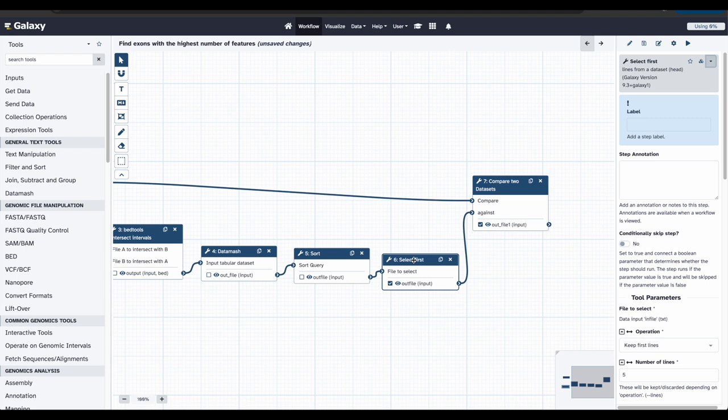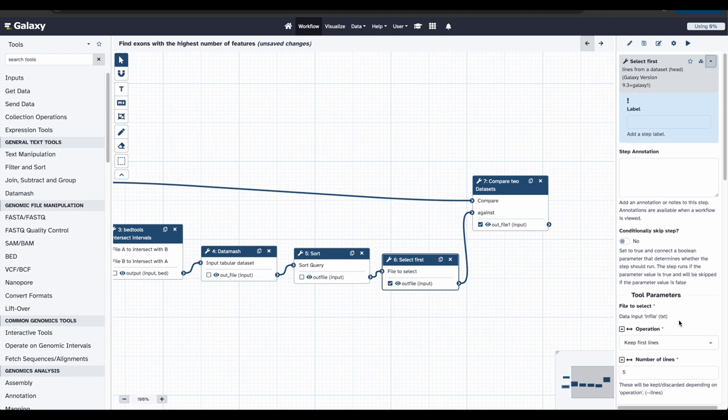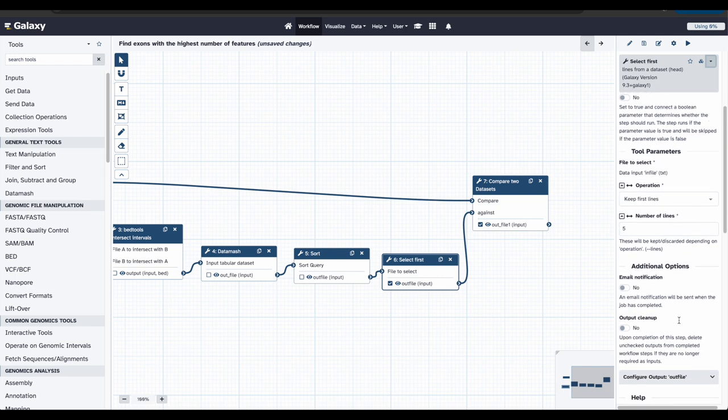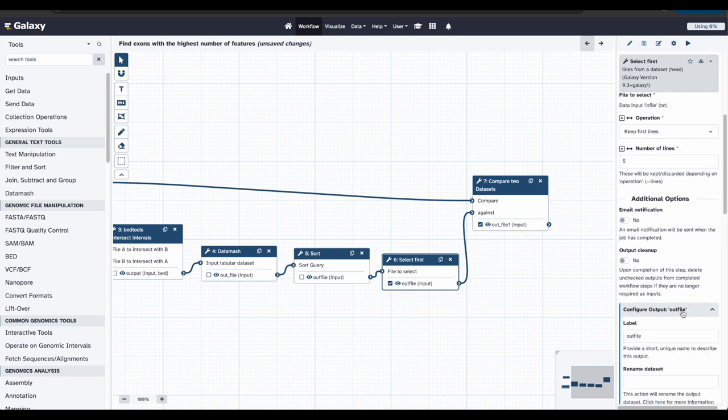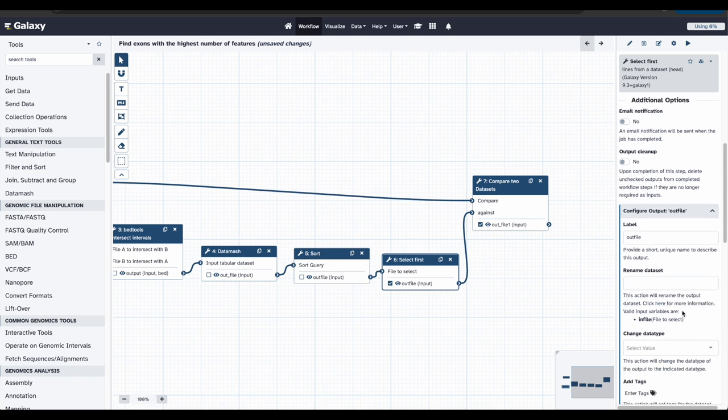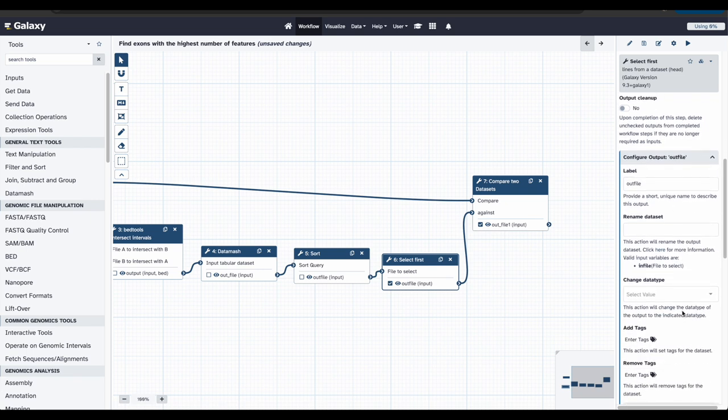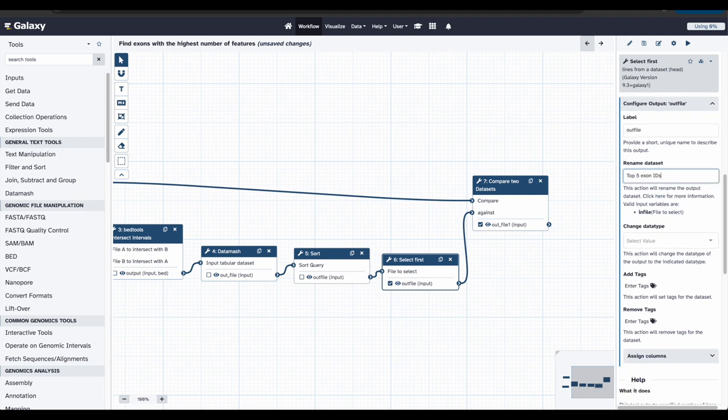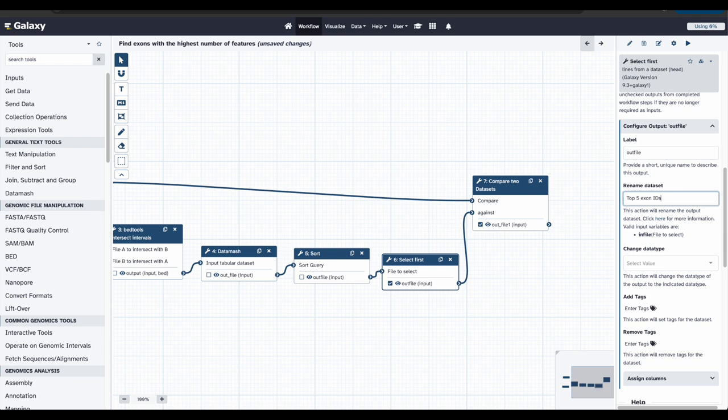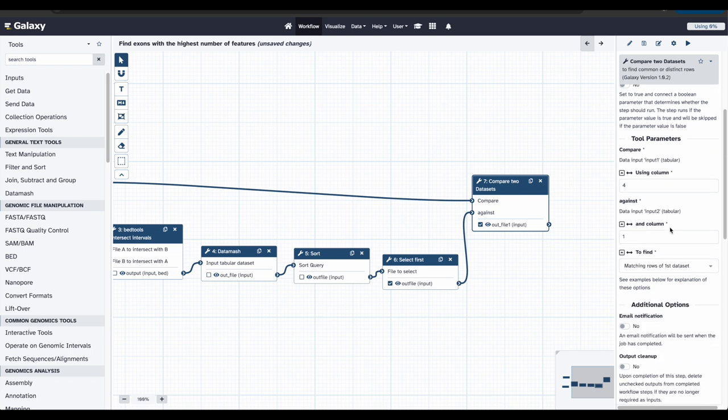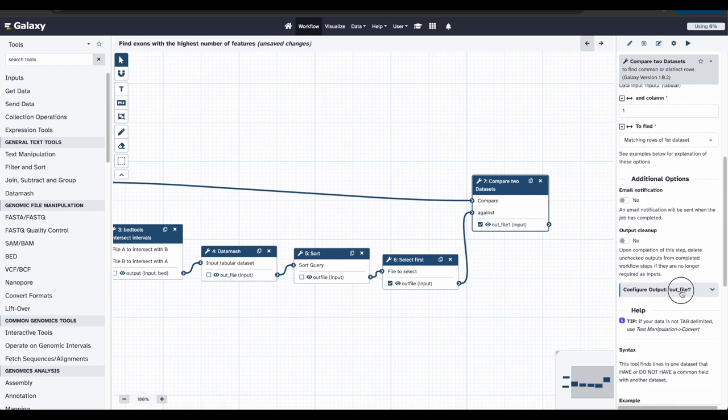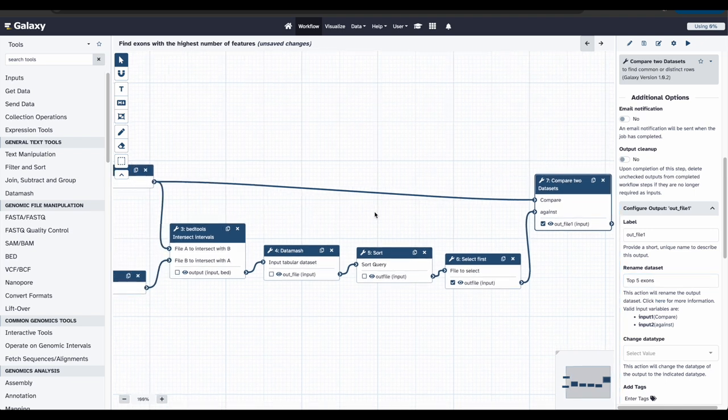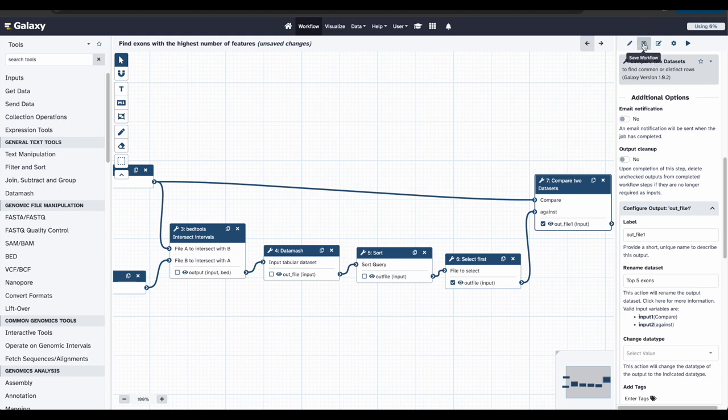Let's also rename the outputs. Click on Select first, and in the menu on the right, let's scroll down and click Configure Output to expand. Under Rename Dataset, let's enter a descriptive name for the output dataset, such as Top 5 Exon IDs. And let's do the same for Compare Two Datasets. Let's name this one Top 5 Exons. OK, this looks great. Let's save our workflow by going up here and clicking Save Workflow. And let's return to the Analysis view by clicking the Home icon.